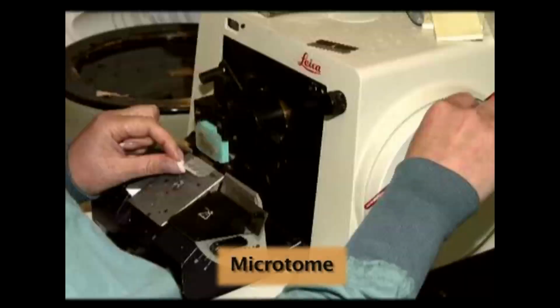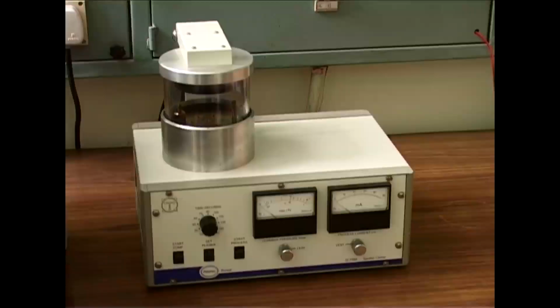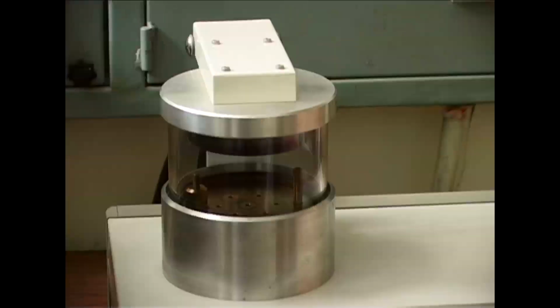Then the sample needs to be dehydrated by grades of alcohol and then embedded in epoxy resin to make a thick hard sample. This is done so that the hard sample can be taken to a microtome to cut very thin or ultra sections. Once the sections are cut, they are taken on a copper grid and again stained with heavy metals and then taken to the TEM facility for imaging.